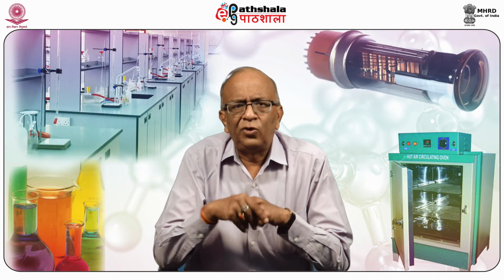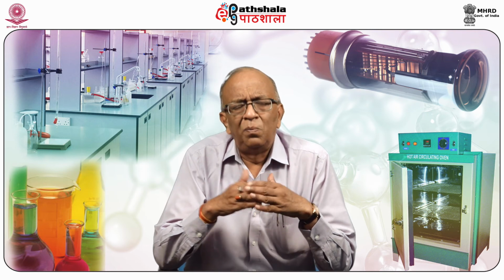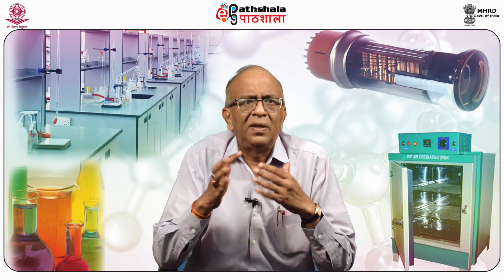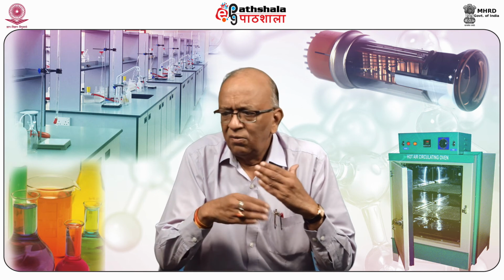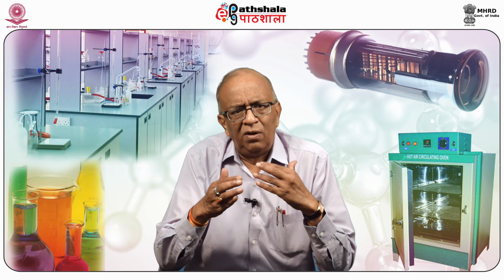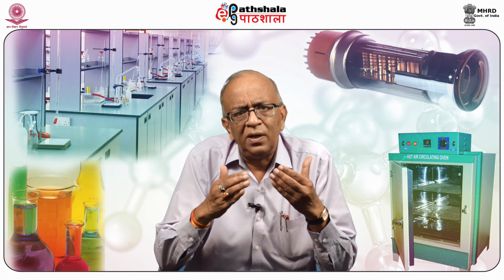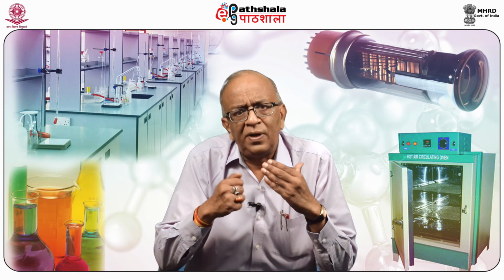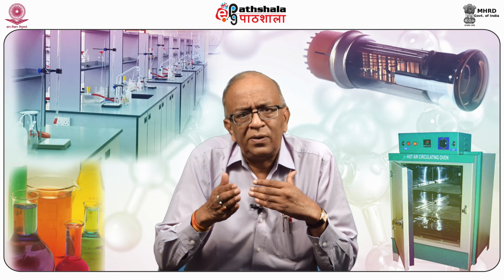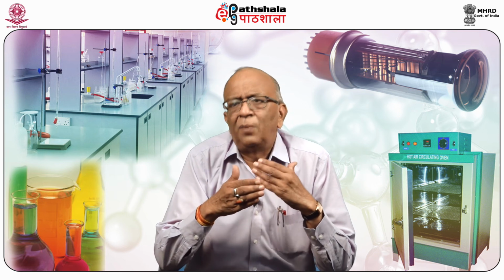So, students, today you have learned how thermal effects, by increasing temperature, affect materials physically and chemically. Physical changes such as melting or boiling may occur at widely varying temperatures depending on the material involved, and this is a characteristic of the substance.